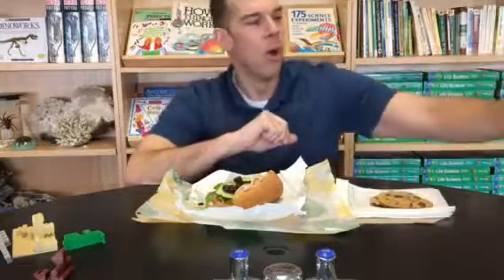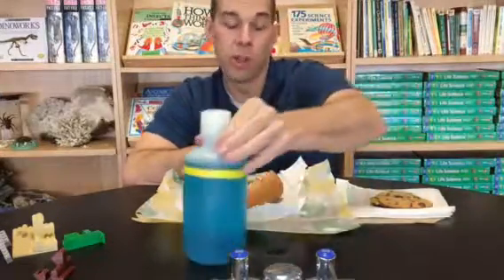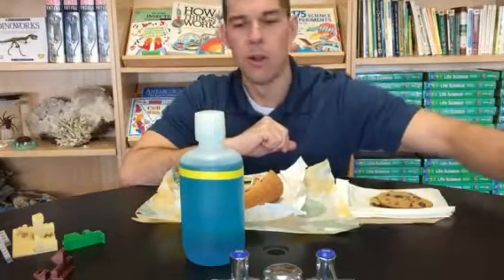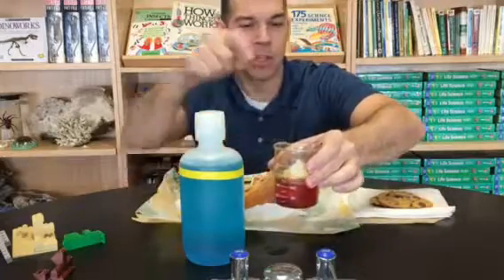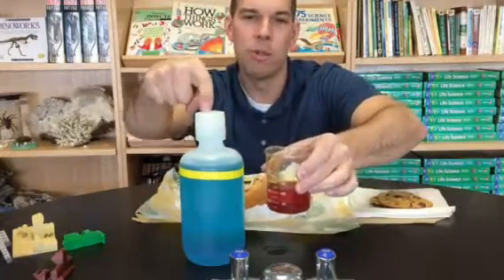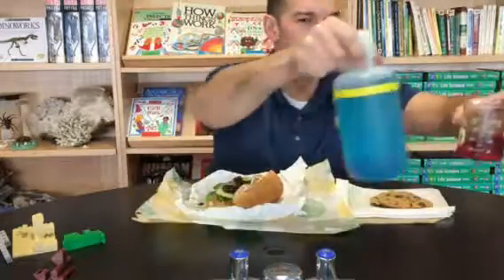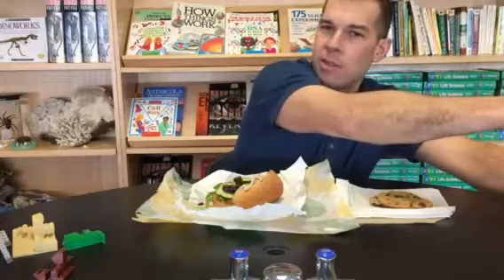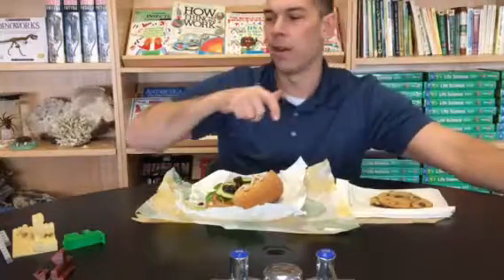Now remember, when we do the carbs or the starch test and the simple sugars test, we're testing for the same thing, except this is testing for complex carbohydrates, which we call starches, and this is the real simple sugars test right here. So they're basically kind of grouped together. There is no test for nucleic acids. We're going to get to that. We're going to have a whole unit on that later.